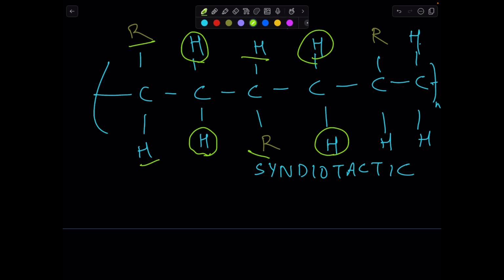So, if we name these hydrogen A and hydrogen B, then they are equivalent. So, they are the same. In an NMR, these two hydrogens will give a single peak with the intensity of two hydrogen atoms, and there won't be any splitting.